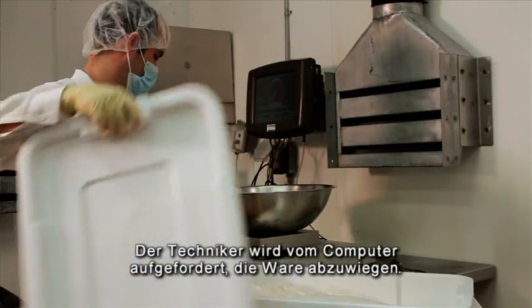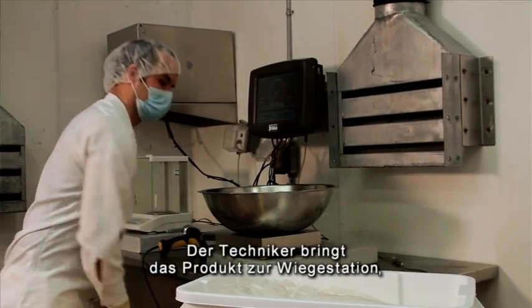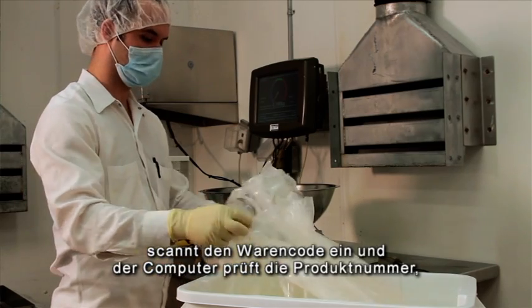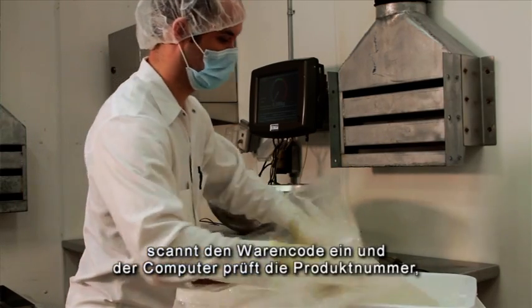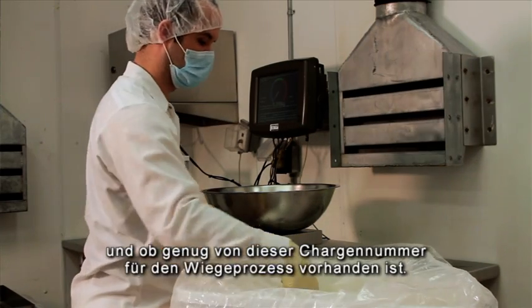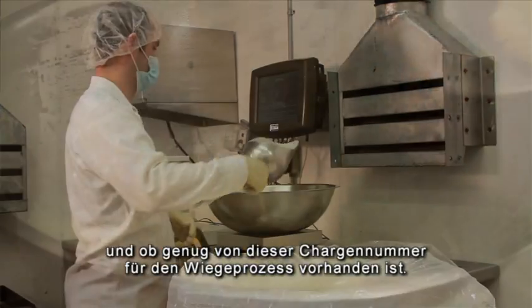The computer will then prompt the operator to weigh a particular item. The operator will get the item, take it into the weighing area, and scan the barcode. The computer verifies that he has the right item number, a valid lot number for that item, and enough of that lot number to complete the weighing process.